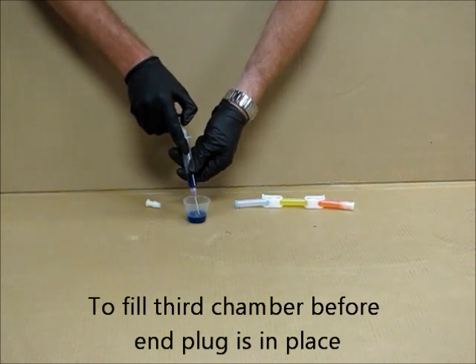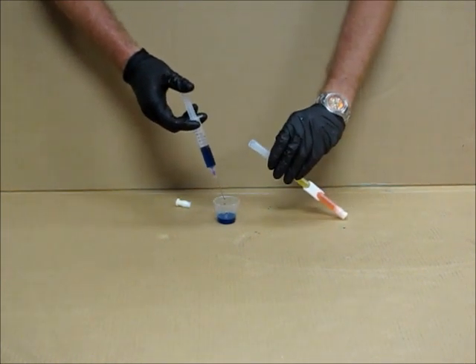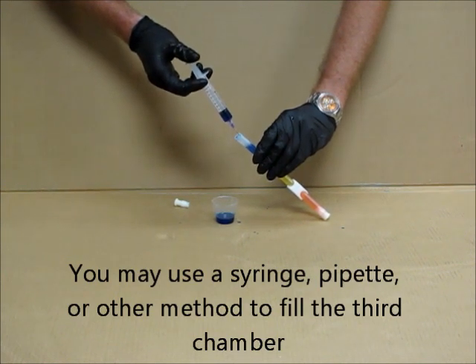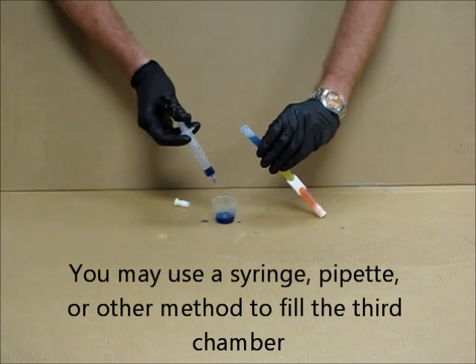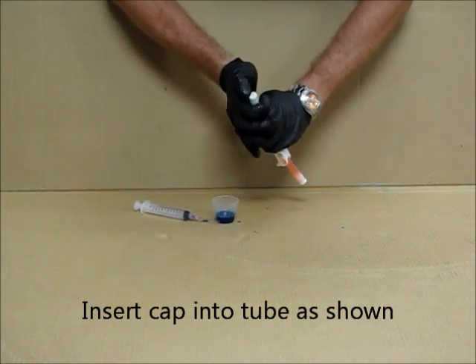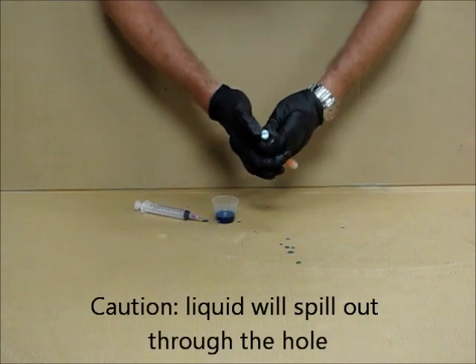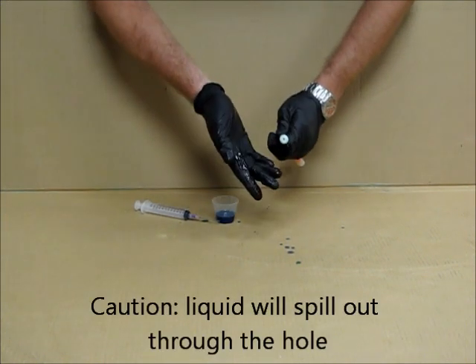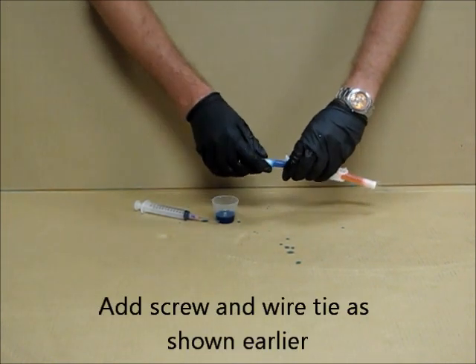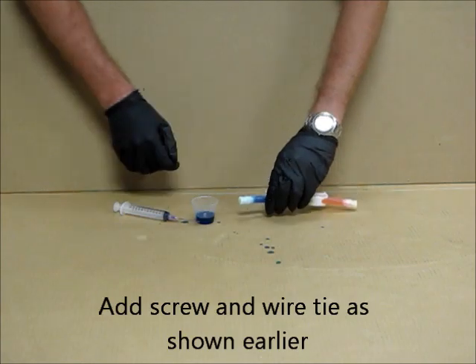An alternate method for filling the third chamber can be used if you choose to fill the third chamber before the end plug is in place. With this method, you may use either a syringe, a pipette, or another method to fill the third chamber. After filling the third chamber, insert the cap into the tube as shown. Take caution as the liquid will spill out through the hole. You may then add the screw and the wire tie as shown earlier.